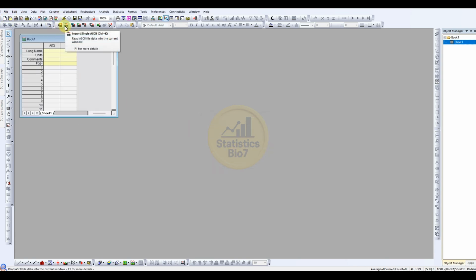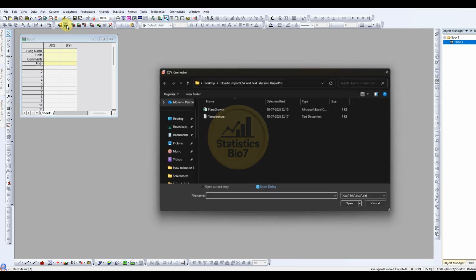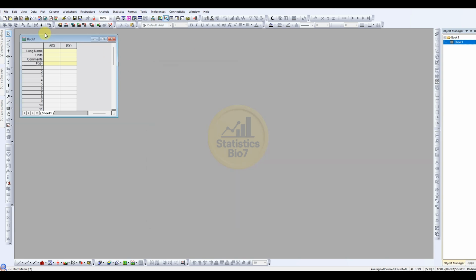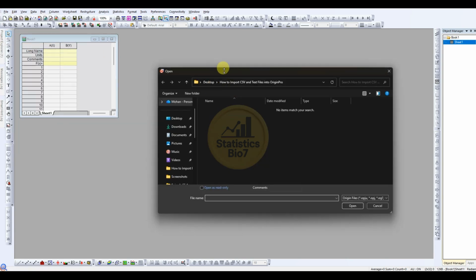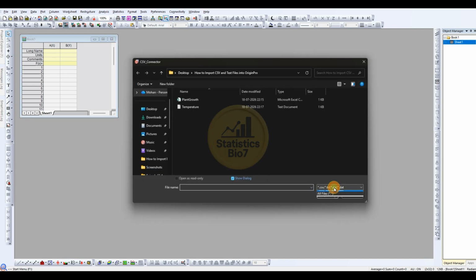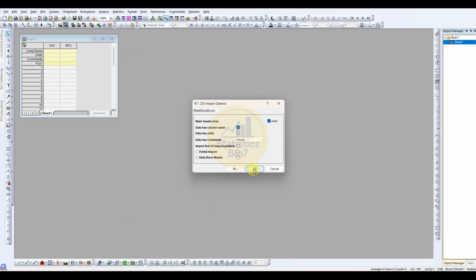The wizard is one method; another is the single ASCII import. This is the correct method to open it. Already this method is shown on this file: open the menu, and there is also a shortcut in the toolbar to import a single ASCII format. Same method: select the CSV, text, ASC and text format. Select the file and click open.